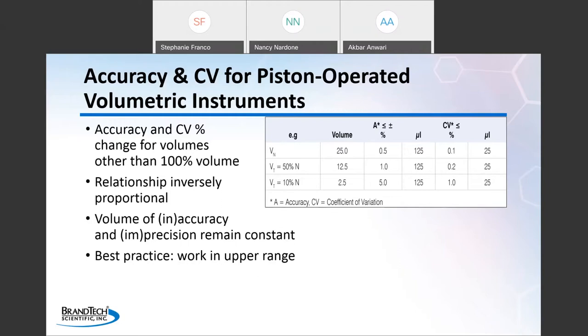Okay, so it seems to be a pretty good spread. Some people use offsite calibration facilities. A small amount have an internal calibration group. Some people have a vendor that comes on site, and a fair amount do their own calibrations.